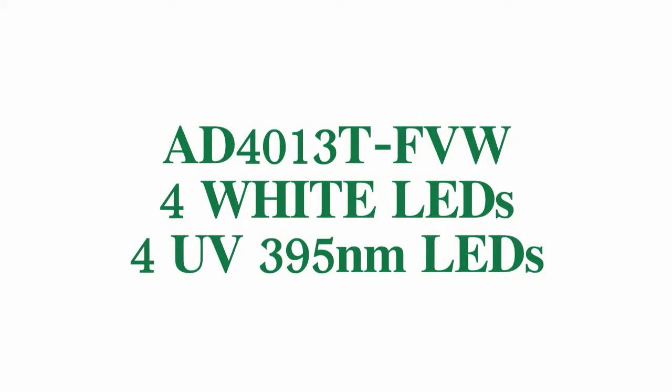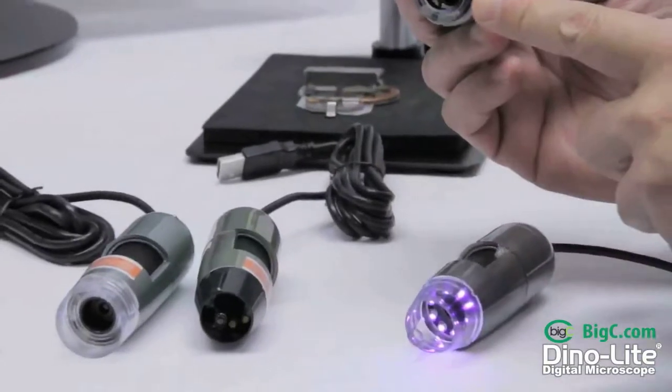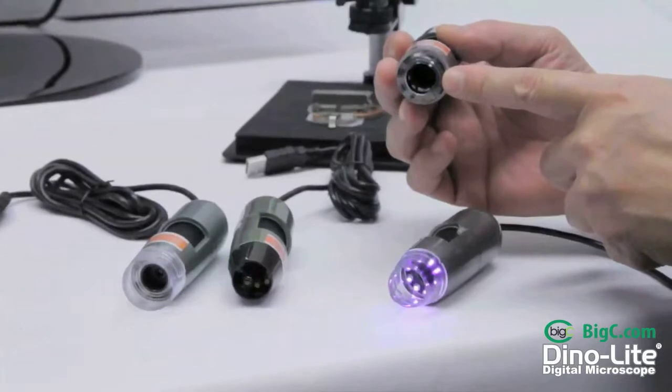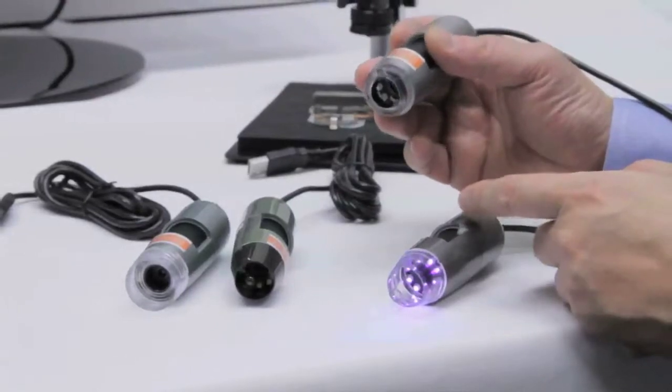Moving on to the AD4013TFVW, this model is unique with four white LEDs as well as four UV LEDs. These UV LEDs are tuned at 395 nanometer wavelength and this particular model has a removable cap.